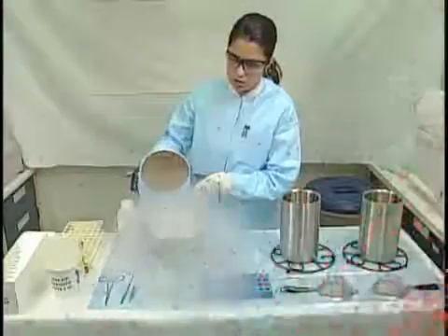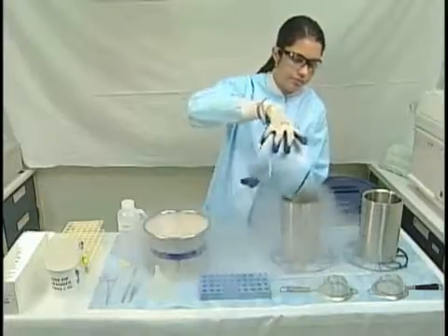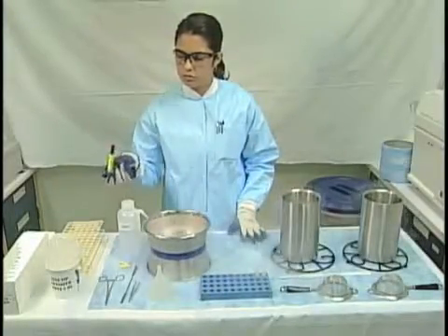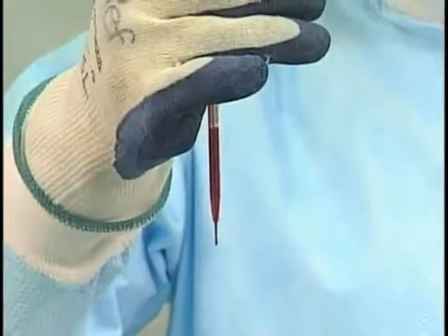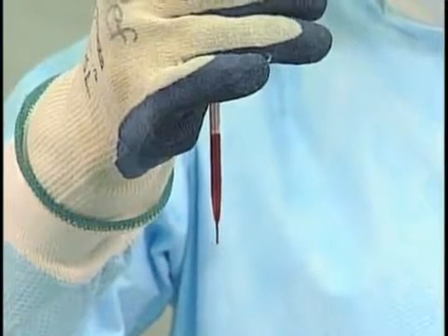Freezing. Set out three metal canisters. Fill two canisters with liquid nitrogen and place a metal sieve over the empty canister. Gently mix the sample and draw it into a fine-tipped transfer pipette. Hold the pipette vertically, 15 centimeters above the liquid nitrogen, and slowly release droplets into the liquid nitrogen.